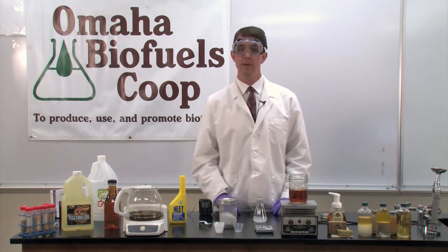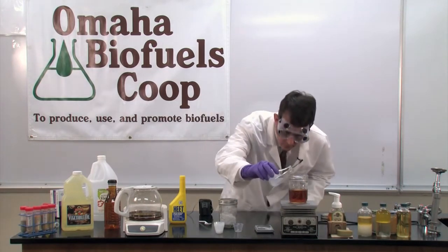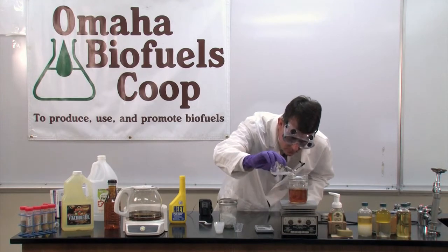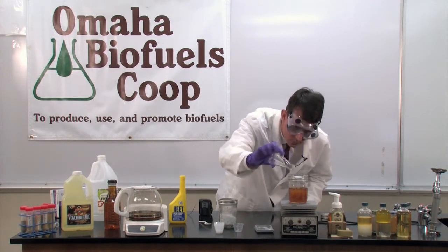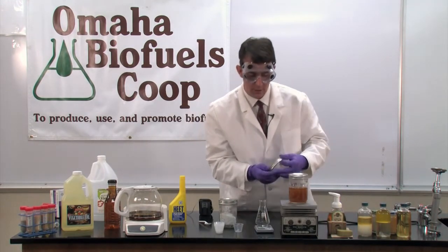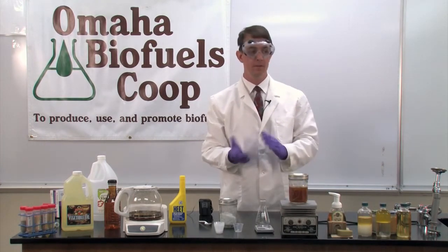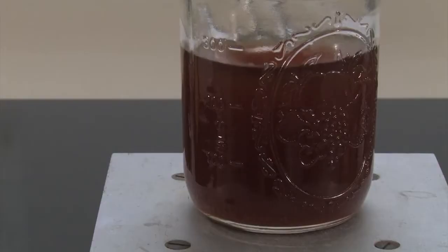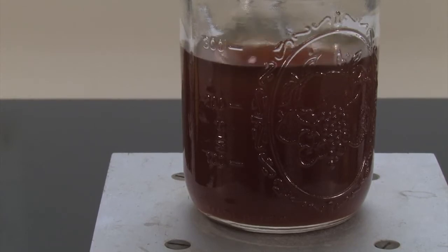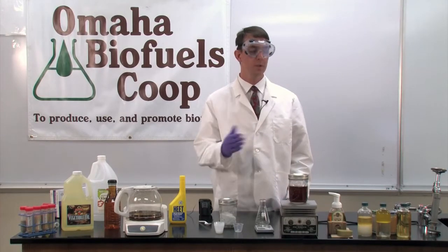Here's where the really good stuff happens. We'll mix the methoxide solution and the heated cooking oil and watch the reaction happen. Initially, we can see the amber-colored oil getting lighter as we mix in a colorless liquid. As the reaction takes place, the glycerol that has been cut away from the vegetable oil will start to appear. Glycerol from used cooking oil is significantly dark — darker than the vegetable oil — and it'll make the entire mixture start to appear dark. Now that we've given enough heat, mixing, and time for the reaction to take place, we'll stop the mixing.